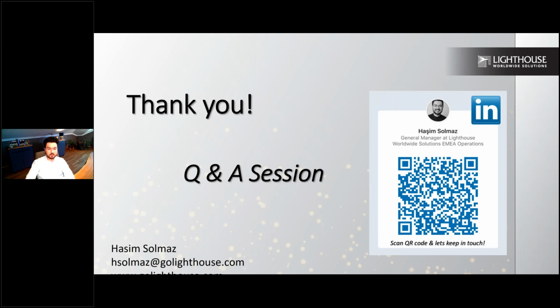Raise the action level. Okay. So if I have an area consistently failing, a charging area consistently failing, is it possible to raise the action level?